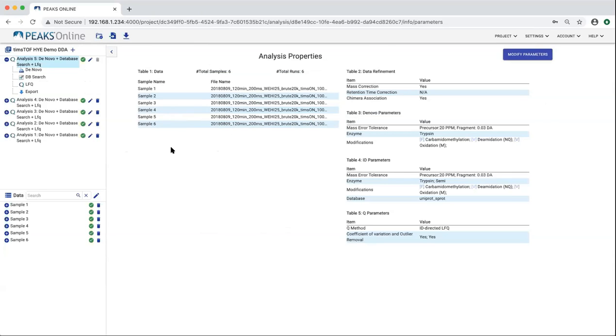And so that's a bit of a different departure from the studio, in which case everything gets redone from the beginning. Here, you would only do the new additions, which makes it a lot quicker. And so what's particularly nice for larger data sets is you don't have to wait for the data set to be finished before you run that. You can just run your sample right away without any issue.